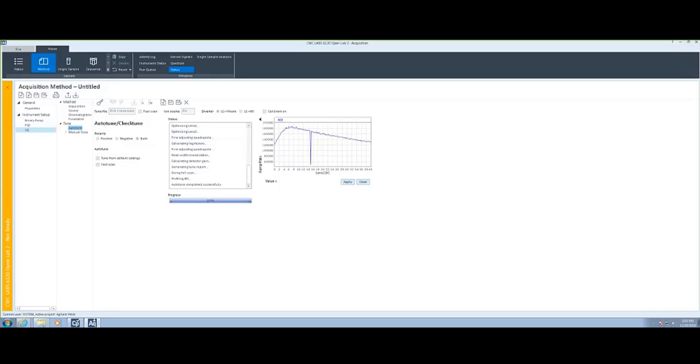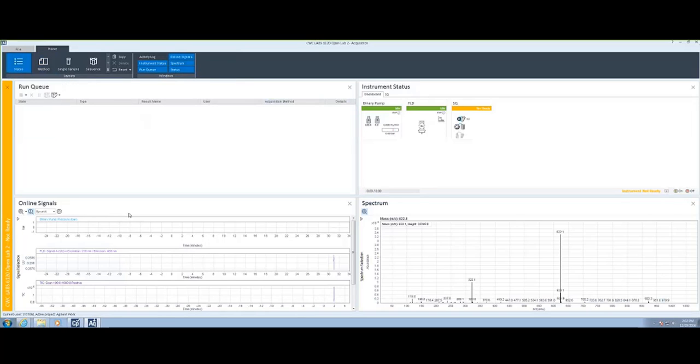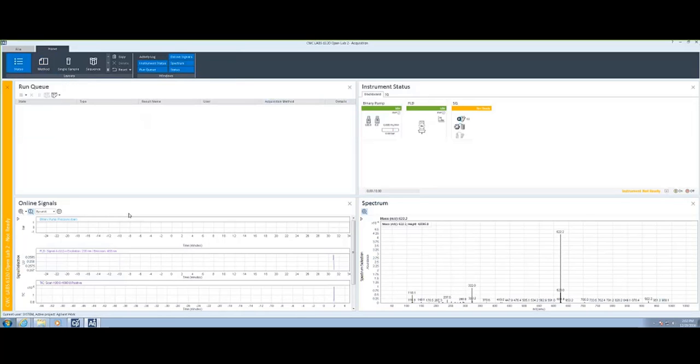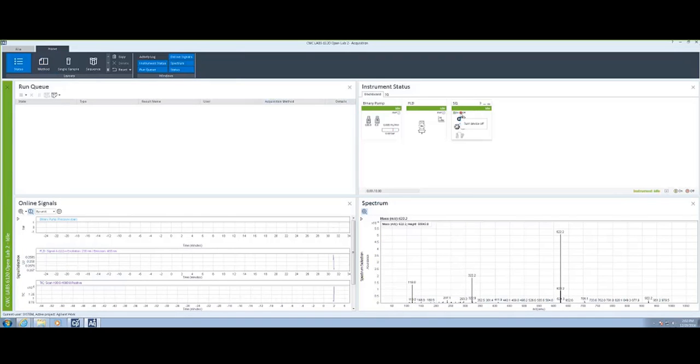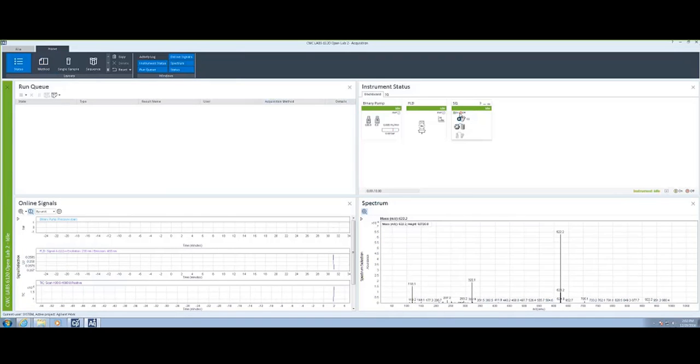Once finished with the method section, go back to the status and it will show you the status of both the LC modules as well as the mass spec.